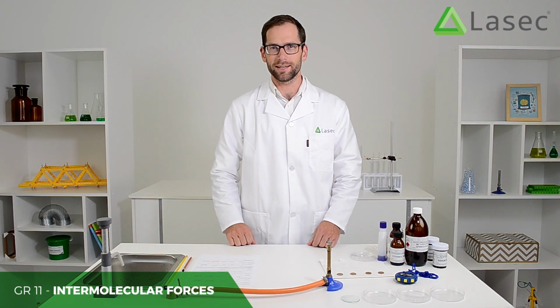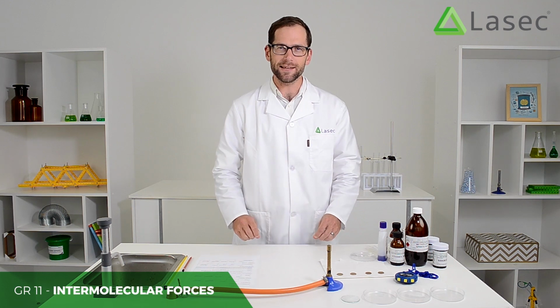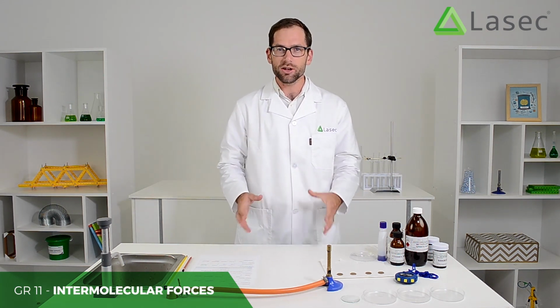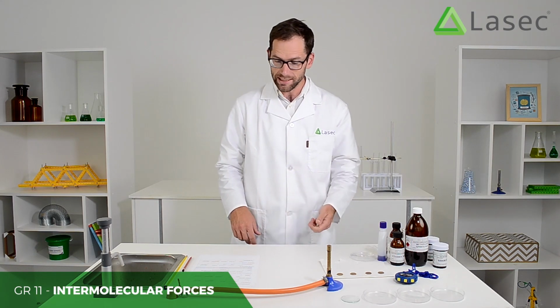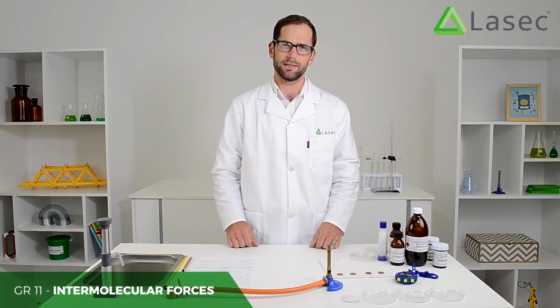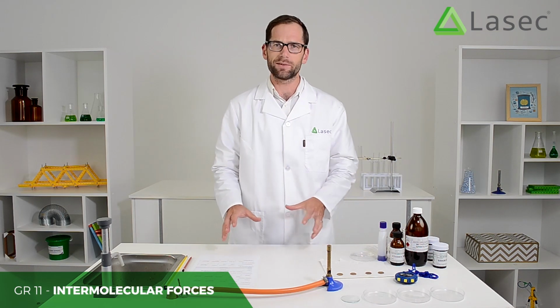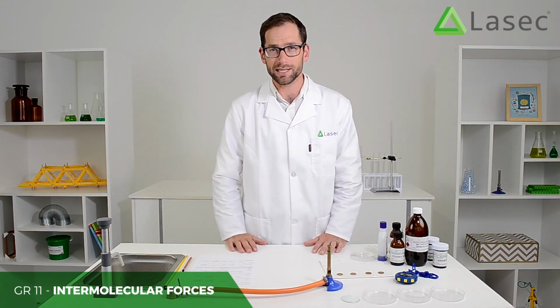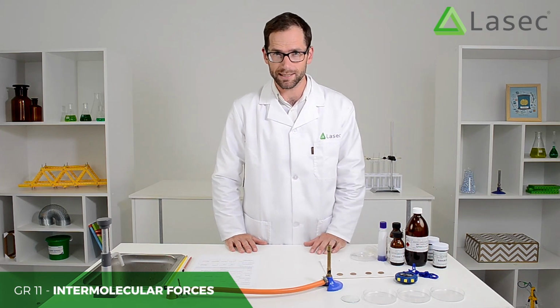Intermolecular forces. Here, learners will have a chance to investigate the effects of intermolecular forces on evaporation, on surface tension, on solubility, boiling points, and capillarity. You need to be really organized with this, have everything set up for the learners and give them plenty of time to do it, because it is a prescribed formal assessment.